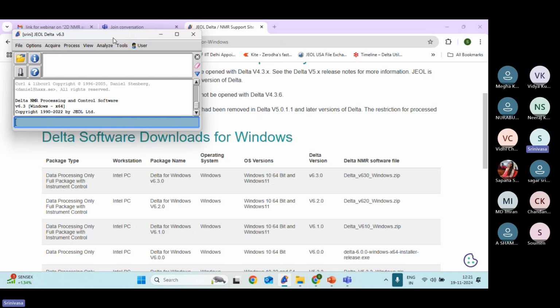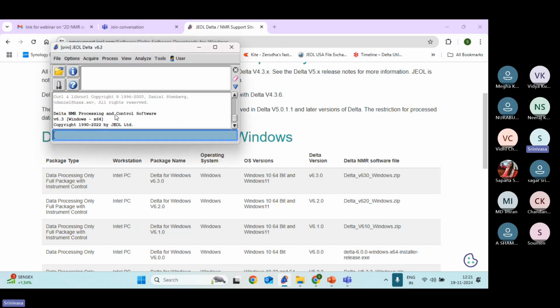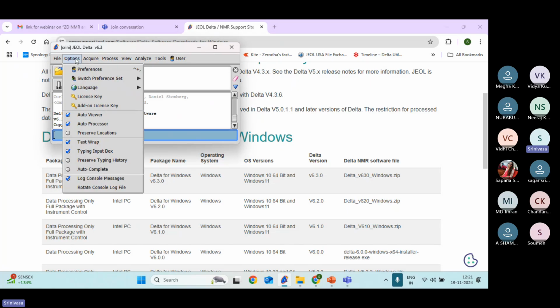let me open the software. It shows an error message here. It says your license is valid only for 15 minutes, it is not active. Then you need to activate this permanently, which means you have to get the license key. How to get that? There are options here. Just find the license key.